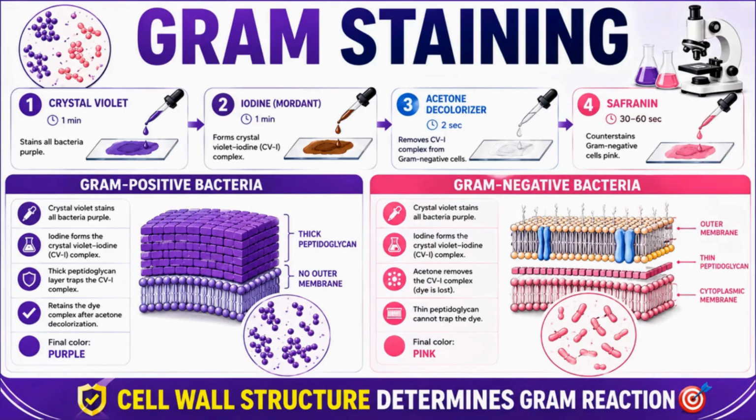So this is a mind map which shows the overall procedure of gram staining as well as the differences in the gram-positive and gram-negative bacteria, which is the main principle of gram staining. So that's gram staining explained from start to finish.